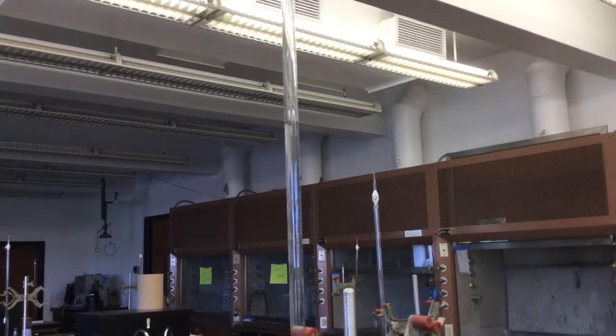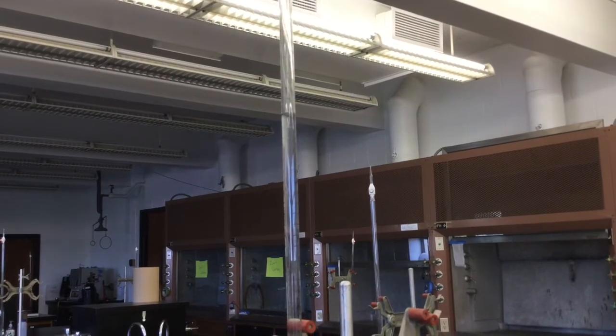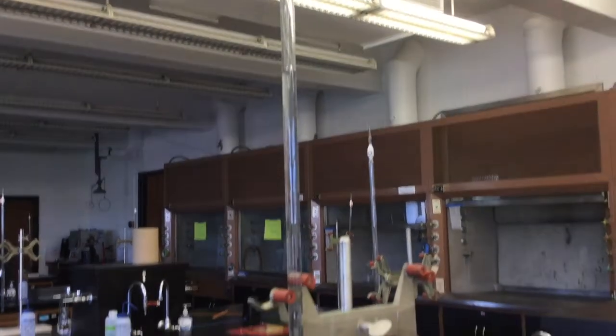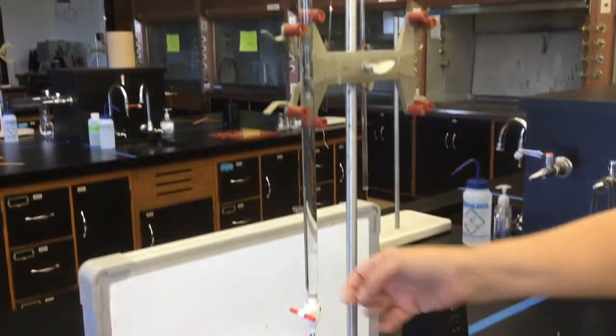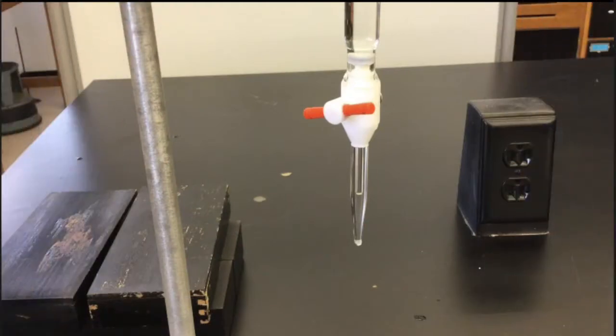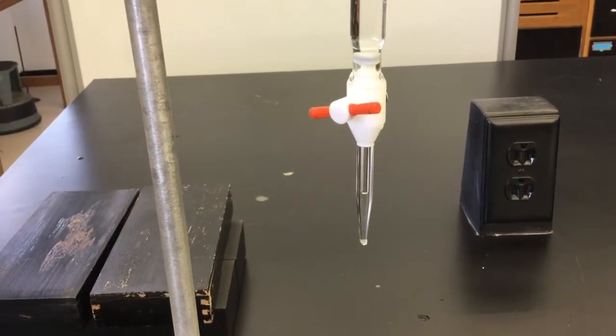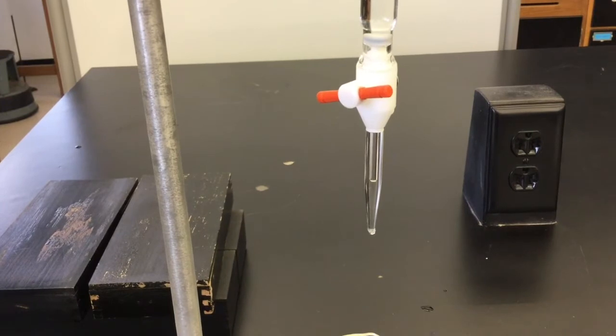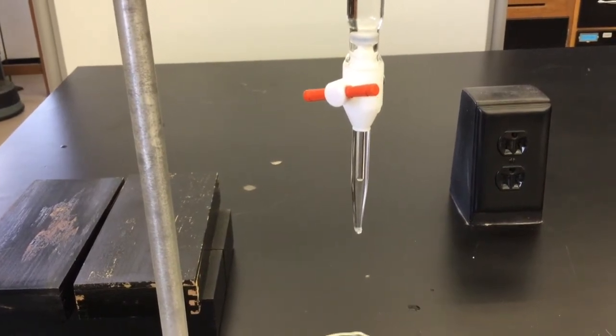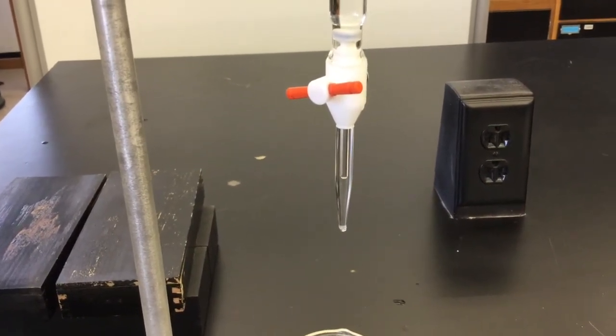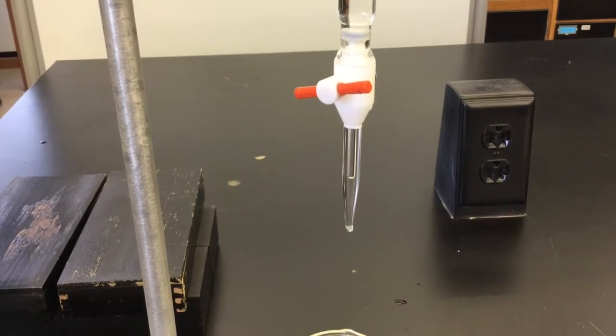Before you begin the titration, you're going to need to make sure there are no air bubbles. Check the burette and the bottom. Notice that there is an air bubble. The presence or absence of an air bubble can change the measurement that we have on our burette. So we want to make sure before we start that the air bubble is gone.